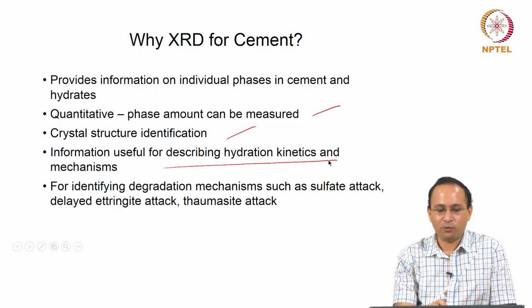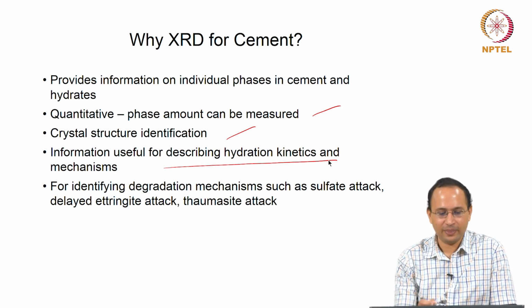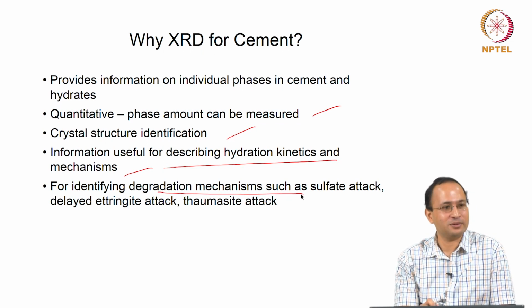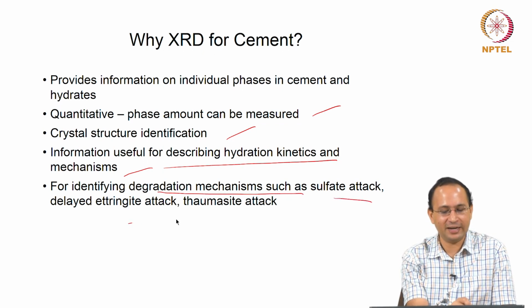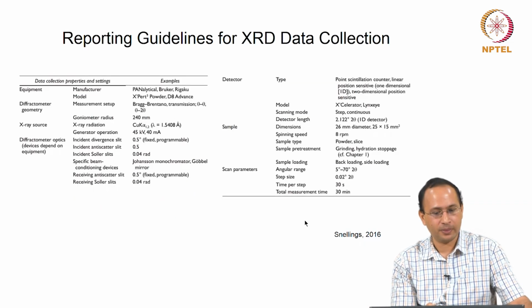Also we can use that information to describe hydration kinetics, you can monitor the hydration mechanism, and also we can use it to identify the degradation mechanisms such as sulfate attack, delayed ettringite attack and thaumasite attack. These are a few examples.